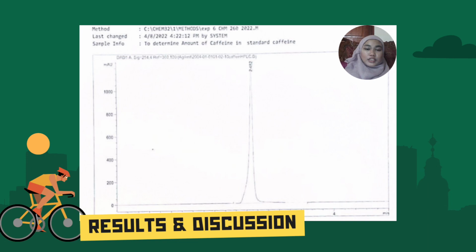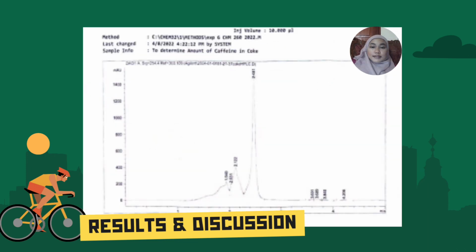We got a retention time of 2.482 at a peak area of 6,249.48. This data suggests a sample with a dominant compound alongside other substances in varying concentrations. Peaks with shorter retention times might represent smaller, more volatile molecules, while later peaks likely correspond to larger, less volatile molecules.